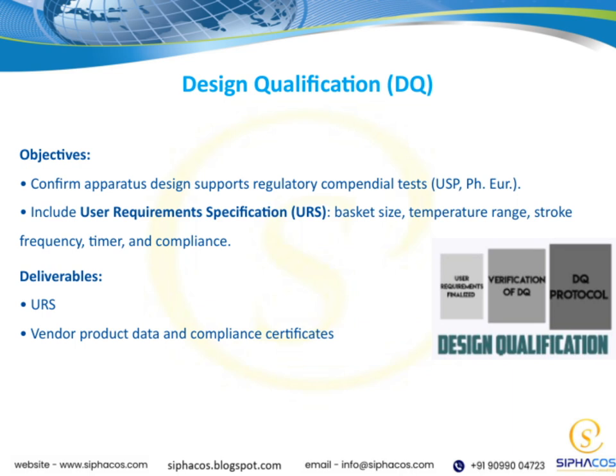Overall, this step ensures that from the beginning, the equipment design aligns with both regulatory requirements and our specific operational needs, setting a strong foundation for the subsequent qualification phases.